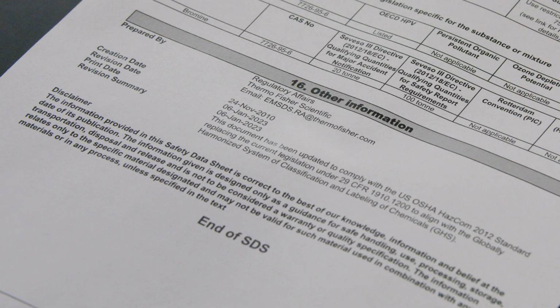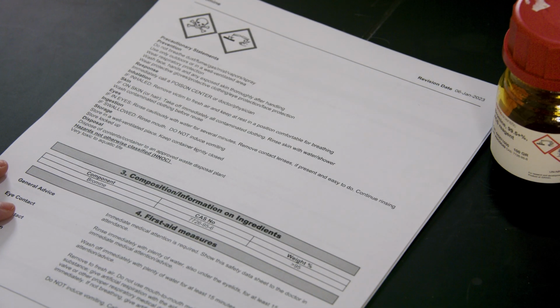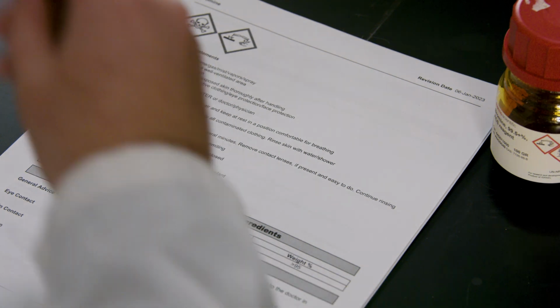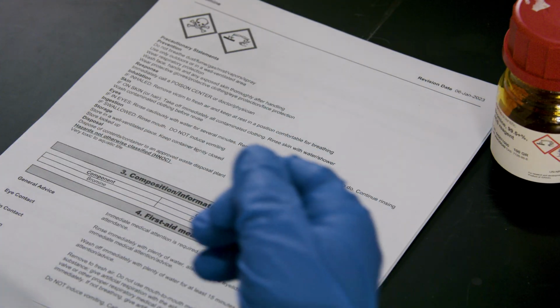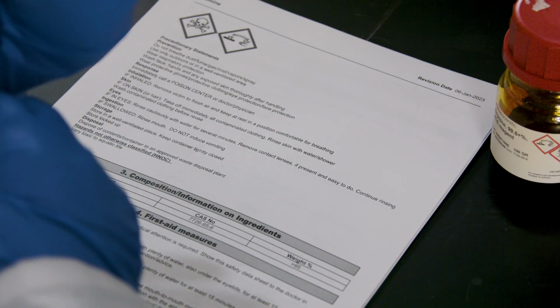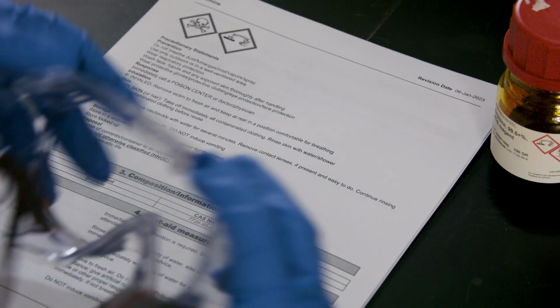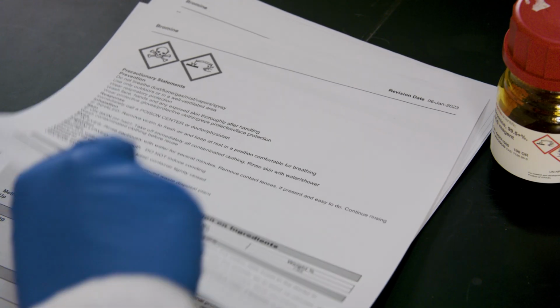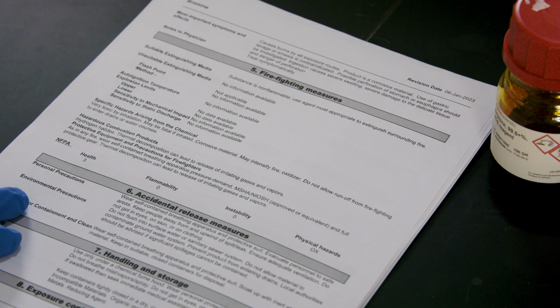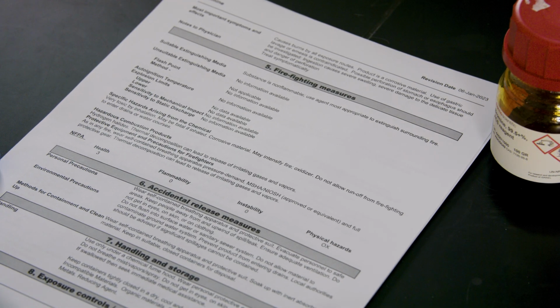Section 16, Other information, is a catch-all for any additional info. Reading an SDS is like having a safety guide for each chemical you work with in the lab. Make it a habit to consult the SDS before you start any experiment. Remember, lab safety is a team effort, and understanding your SDS is a crucial part of keeping yourself and others out of danger in the lab. Stay safe, stay informed, and enjoy your journey in the world of science.